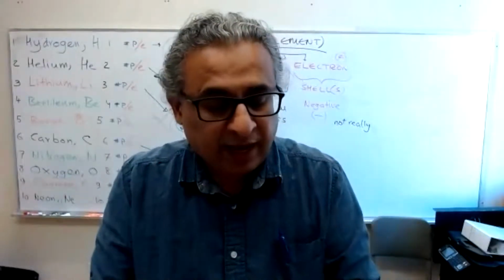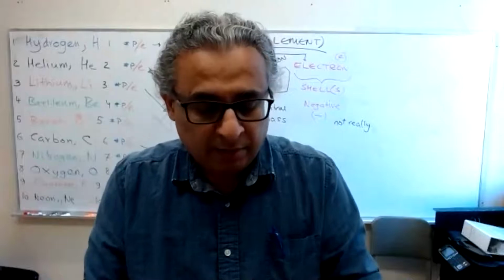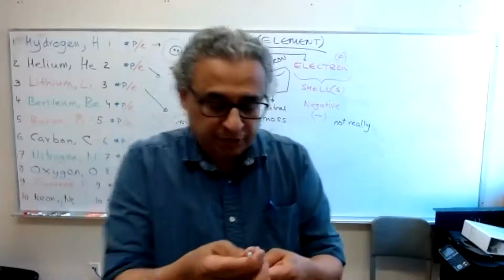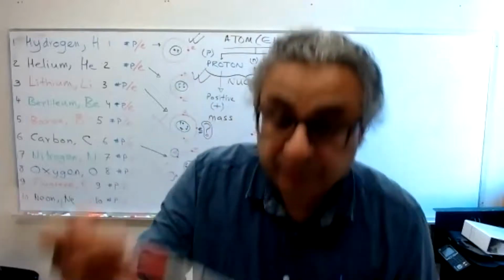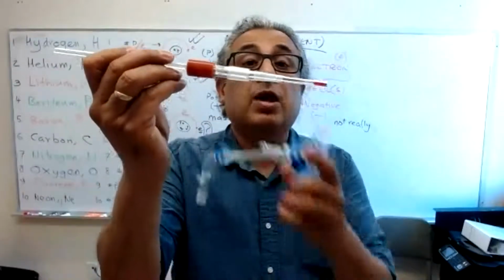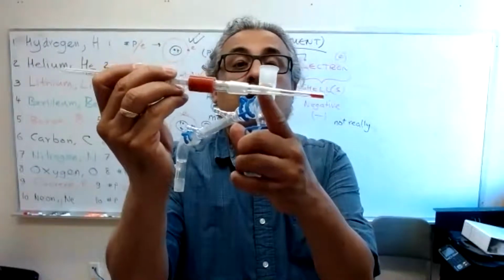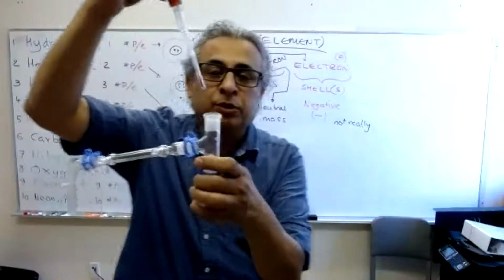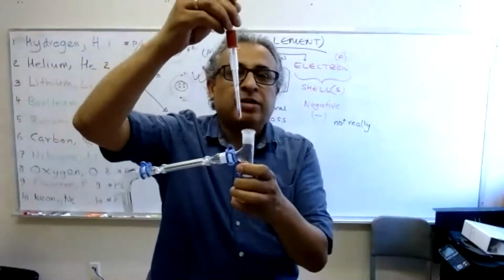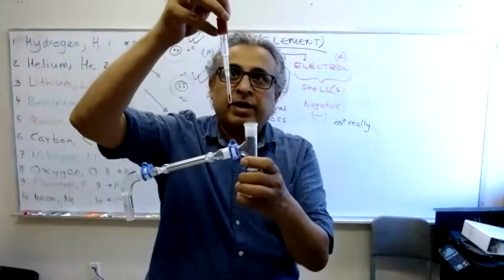This one actually has a ground glass joint, but I'm just going to show it to you for the sake of argument. This is not meant to be used because the thermometer itself has a ground glass joint and it's not meant to be attached here. But pretend that this is the right thermometer and it's got the right adapter.